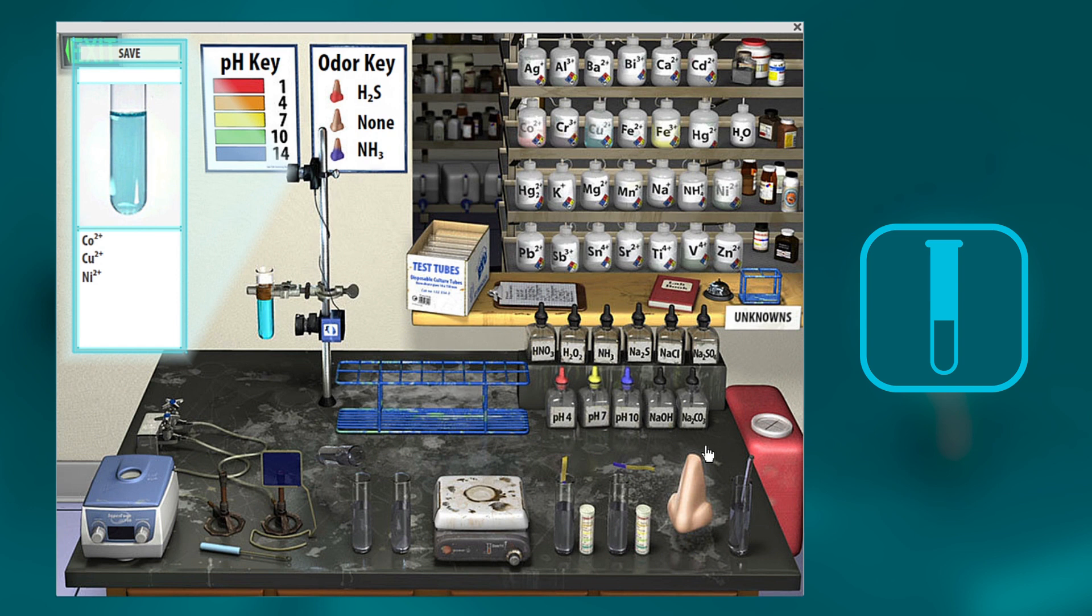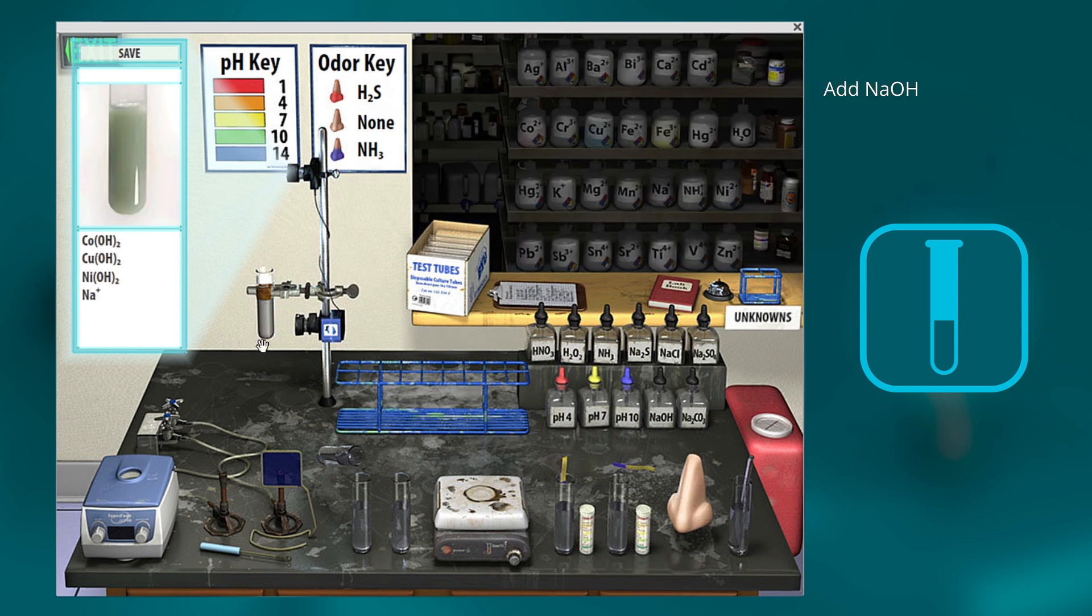To start off, we'll add sodium hydroxide. You can see the formulas in this box that shows you what has been formed so far. When you're doing this with an unknown, you won't see these formulas, but I'm showing you what we have now just to make it simpler for you.